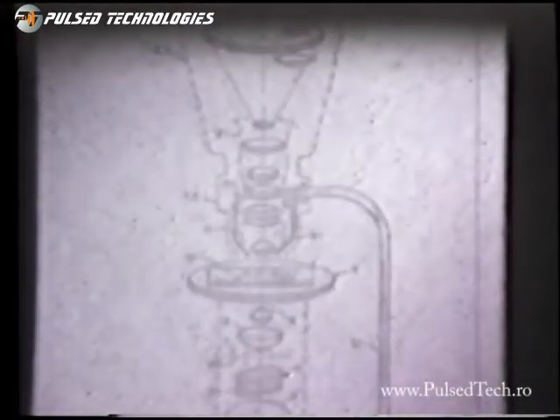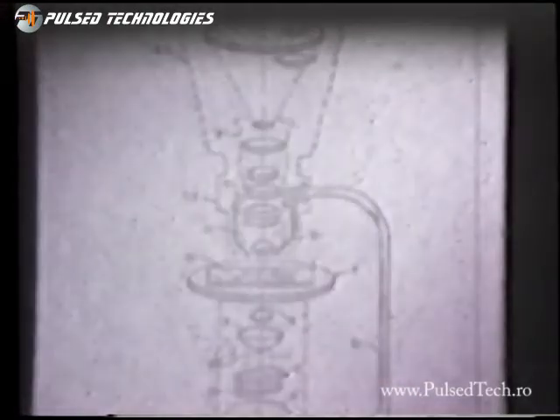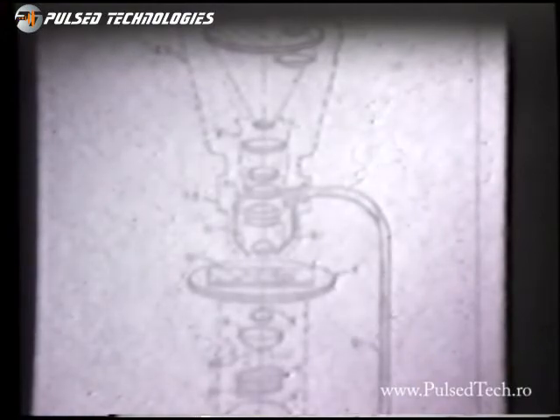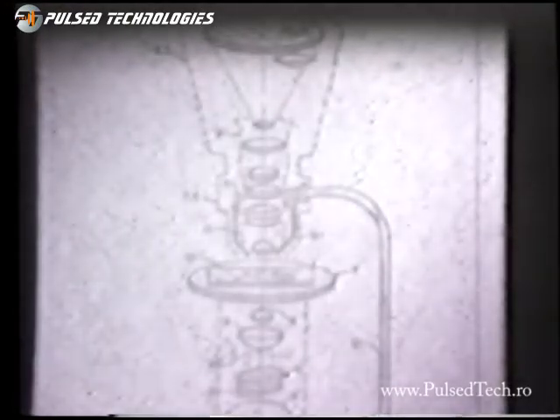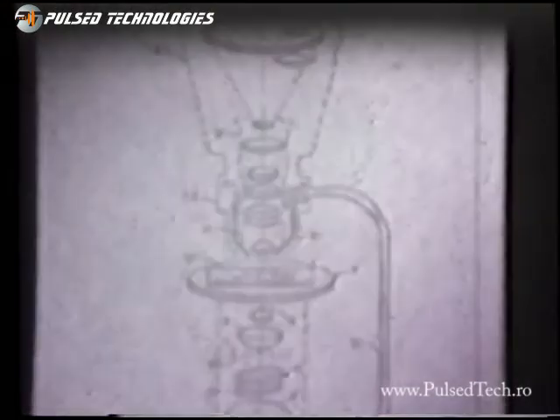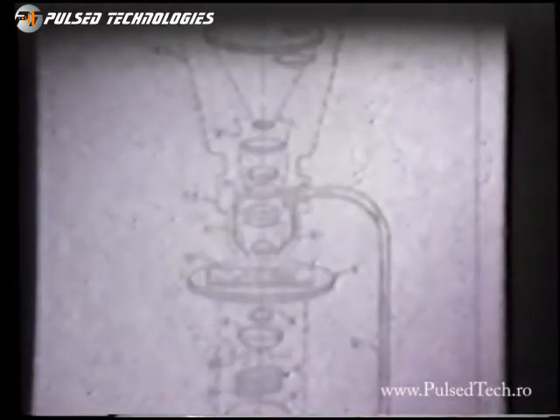This is another patent drawing showing the optical path of the light from the base to the top, which is projected on up by the condenser lenses, the optical oculars, and the eyepieces, and projected on out with a special mirror which goes to a screen 10 foot away. It could also go to a television camera, which would increase the power another 10,000 times.